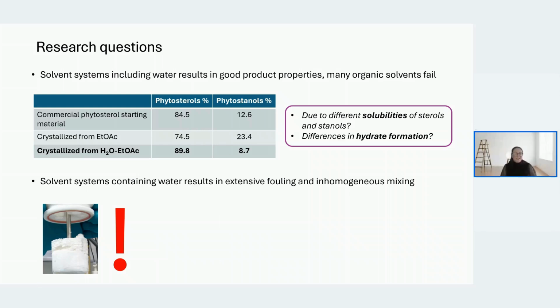Another thing that we observed, unfortunately, was that when we have water in the solvent system, we end up with extensive fouling and inhomogeneous mixing during the crystallization. On this picture behind you can see, well, this is a bit exaggerated figure, but still the behavior becomes really fluffy, and mixing or pumping that kind of material further, for instance when you do upscaling, is practically impossible.